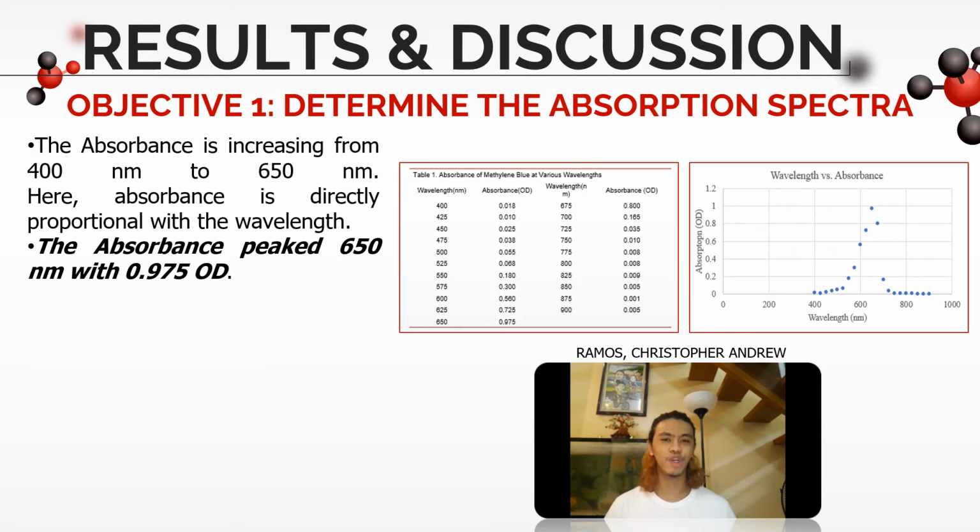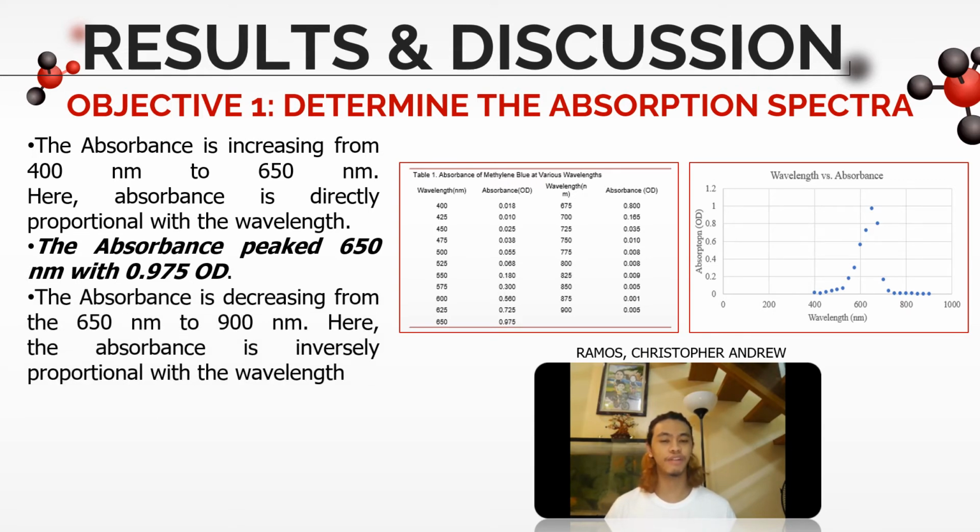Lastly, after the absorbance reached its peak at 650 nanometers, it started to decrease from 650 nanometers to 900 nanometers. In here, the absorbance is inversely proportional with the wavelength, which means that as the wavelength increased from 650 nanometers, the absorbance decreased.